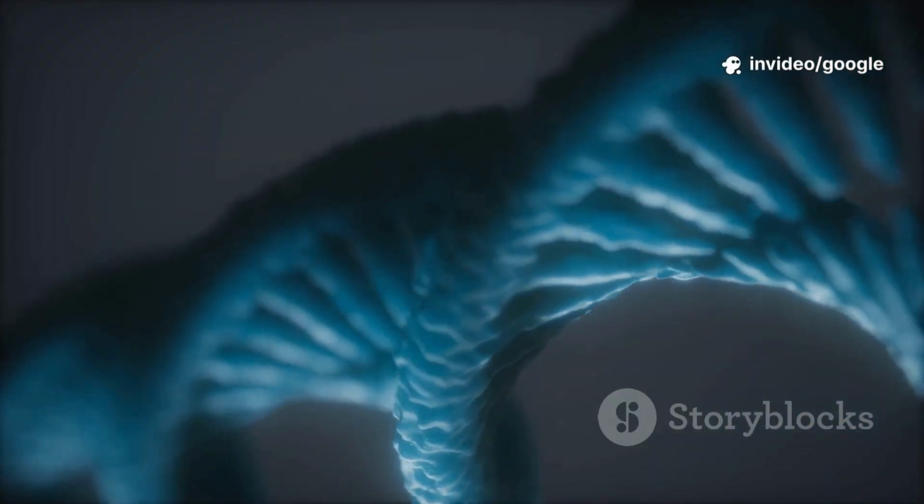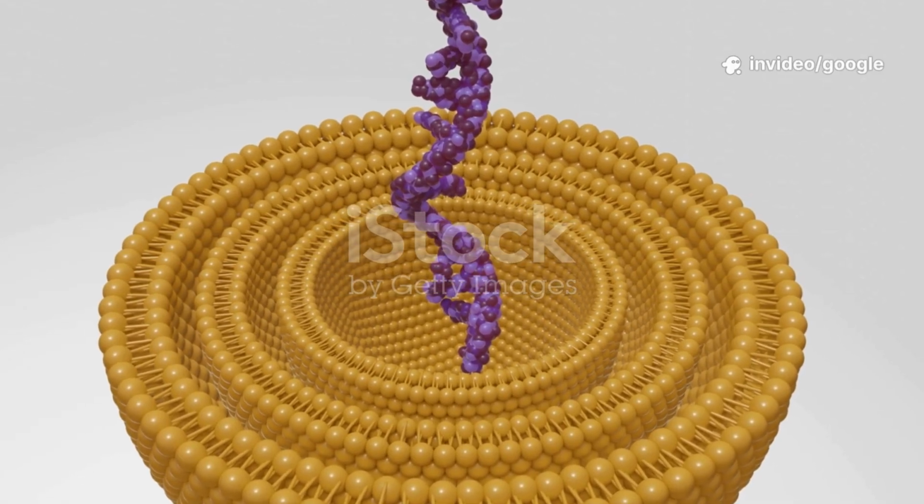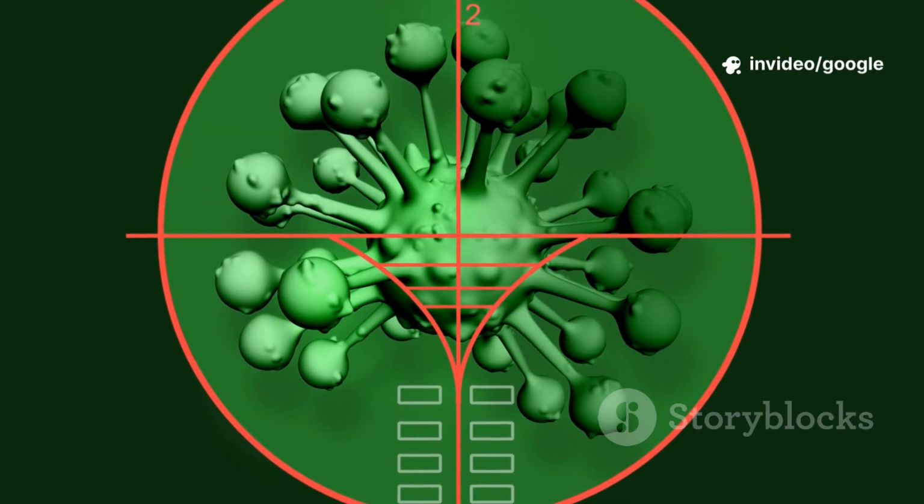Design the 20-nucleotide spacer. This is the critical part of the gRNA that will be complementary to your target DNA sequence, the protospacer, located immediately upstream of the PAM. It's essential for high specificity.